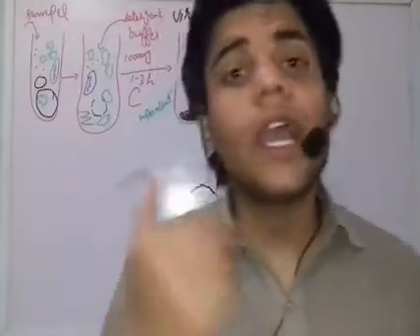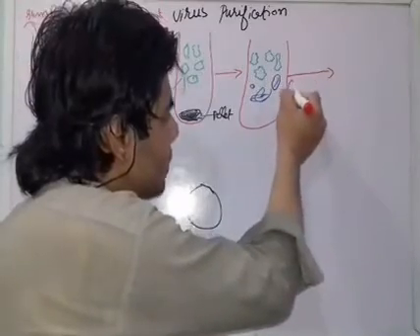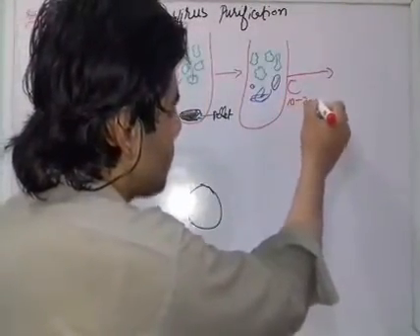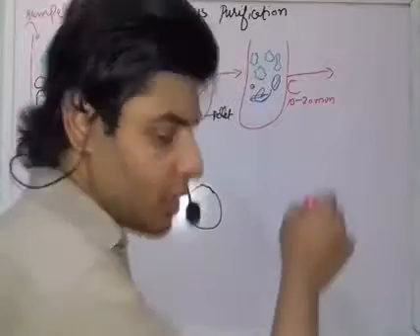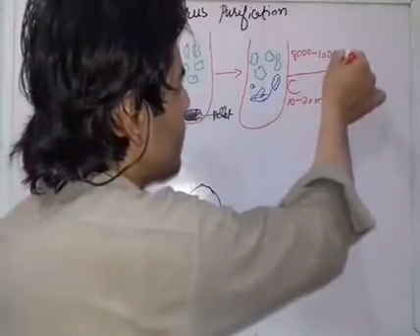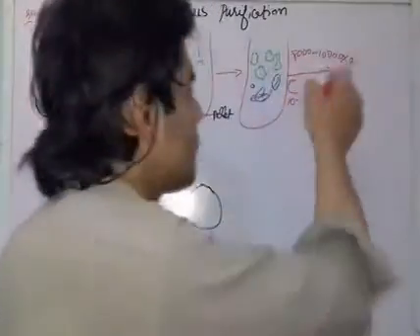Now after that we again centrifugate this tube. C means centrifugation. Now we centrifugate it for 10 to 20 minutes at a speed of almost 8,000 to 10,000 speed. At that speed we again centrifugate it. Fine. So now after the centrifugation, what do we get?